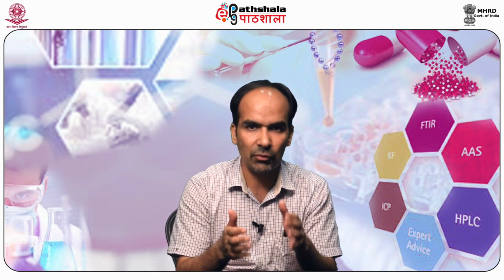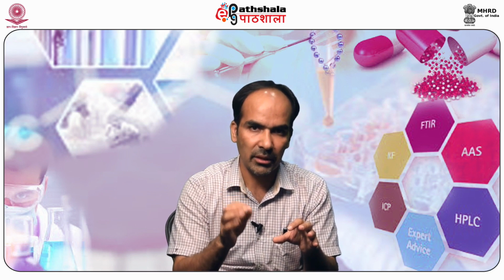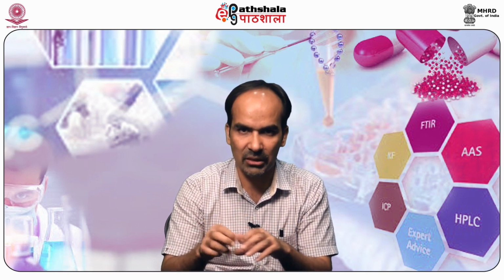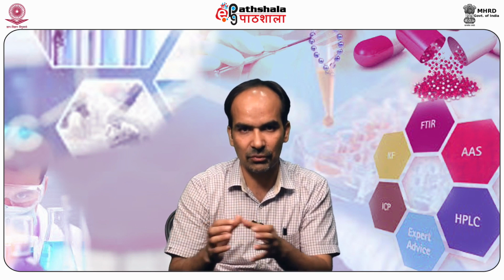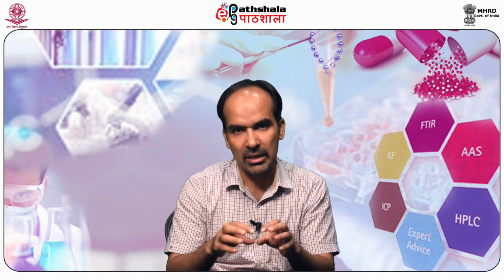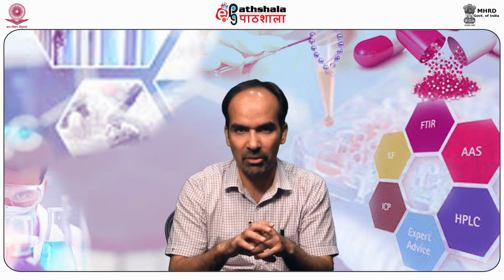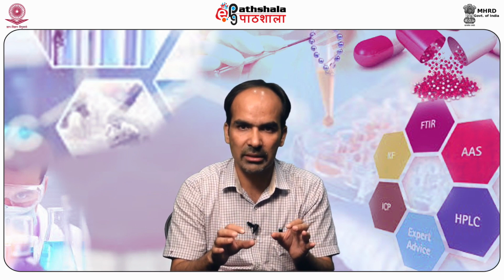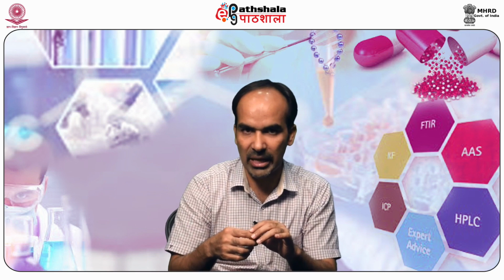So here what we do is that the substance to be analyzed is treated with some chemicals which result in the formation of a color reaction, and that visible color is measured, or the absorbance is measured, which is the basis of colorimetric analysis. When pure solutions are not available for analysis, this is particularly useful for these types of analysis.